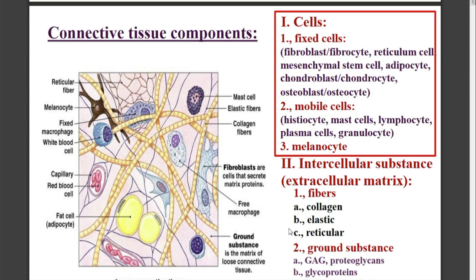Now I will show you the fixed connective tissue cells. These are the fibroblasts and fibrocytes as we saw before, reticulum cells — next week's material but I will show you now in the lymph node — mesenchymal stem cells. We cannot show them in our slides because it would need special techniques to demonstrate them, and the adipocytes. These are the cells of the connective tissue proper.